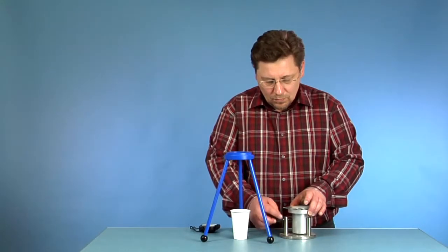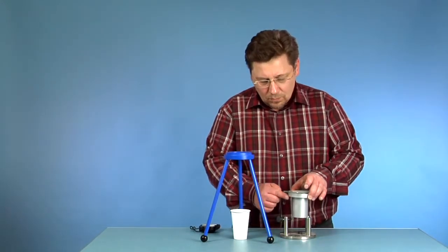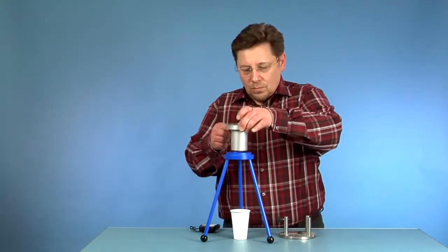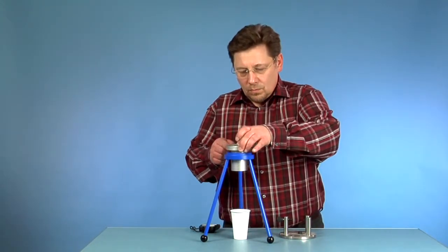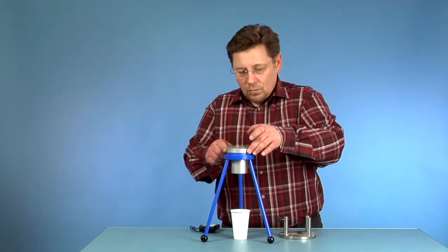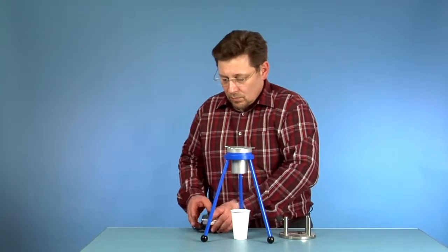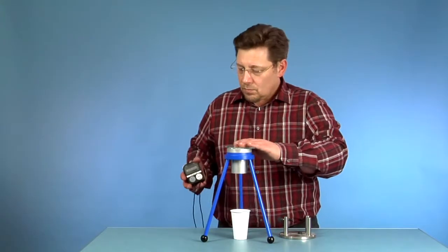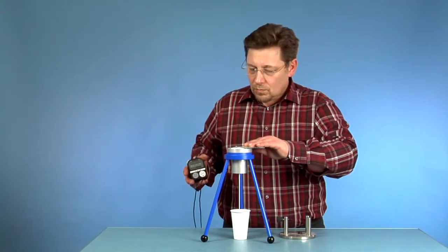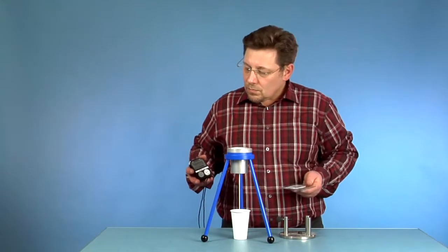Remove the flow cup from the filling support stand and insert it in the tripod stand. Remove the glass plate and start the calibrated stopwatch simultaneously.